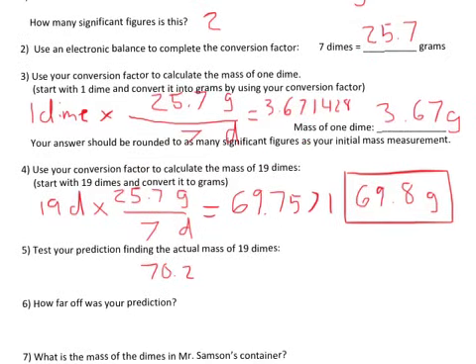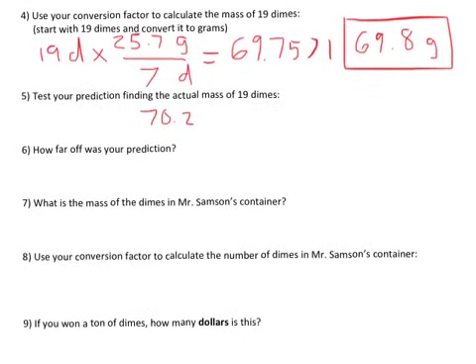Well, let's just move this up a little bit. Okay, so as I was just saying, what you're going to do now is take your value here, which was 70.2. Well, look what I did. I forgot to put grams. Don't do that. You've got to include your units.